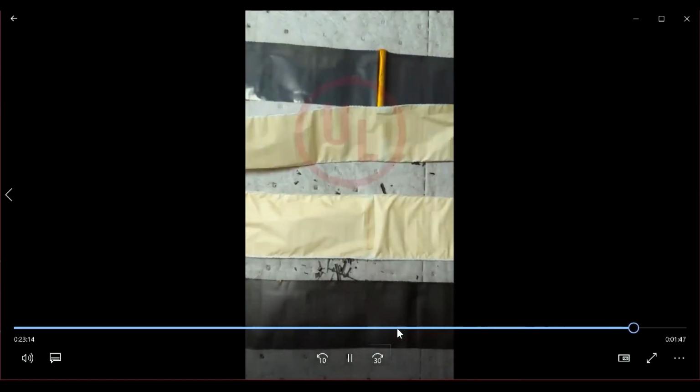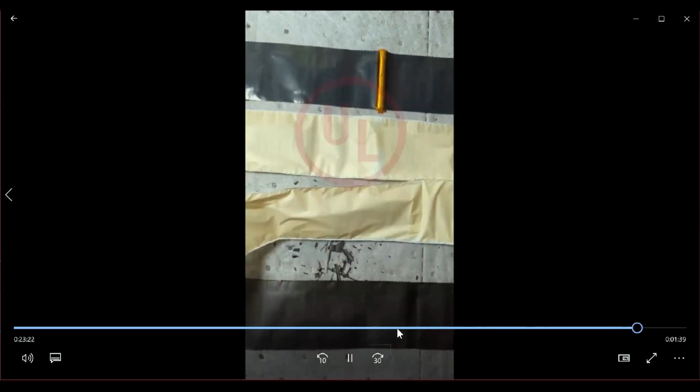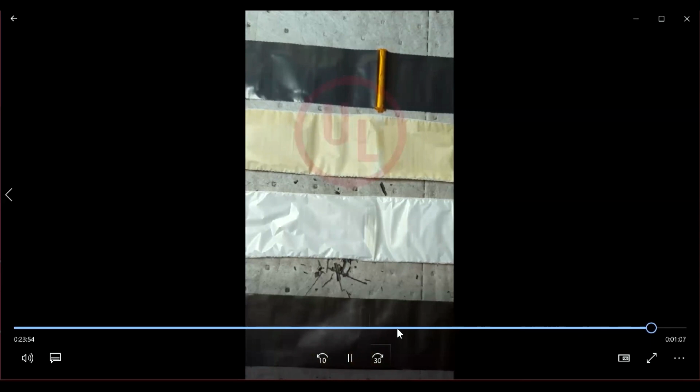It's just showing you both sides of the electrodes. Again, you can see that one of the sides of the separator has this yellowish tinge, and the other side of the separator does not. And I just want to remind you that the side with the slight yellowish tinge is actually the side that has the ceramic coating on the separator, and that side faces the cathode. So to conclude, from these materials, you can actually take samples and do scanning electron microscopy, energy dispersive spectroscopy, and so on. And you can do this for both the cathode and the anode, as well as the separator.